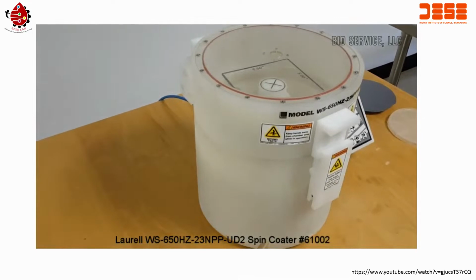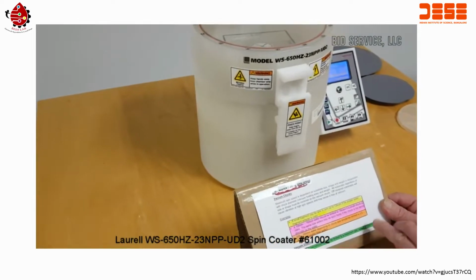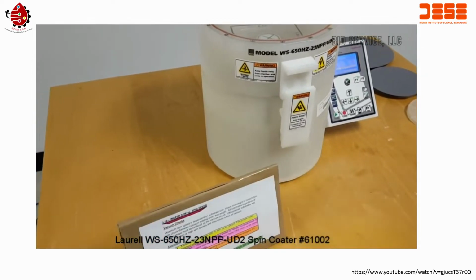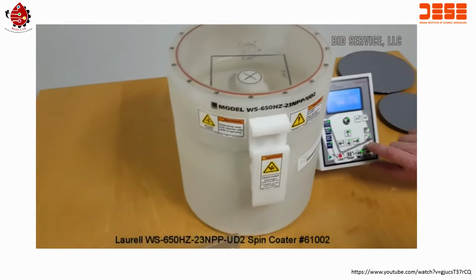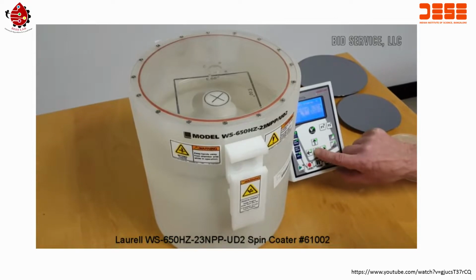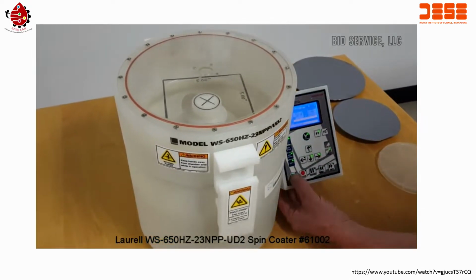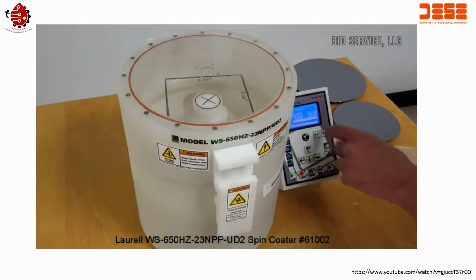Now I'm going to spin this one. Since this is closer to the larger size, which they recommend between 2.5 and 3.5 KRPM, I'm going to spin this at 3,500. And here we go. Vacuum first. There we go. Ready, lights on.